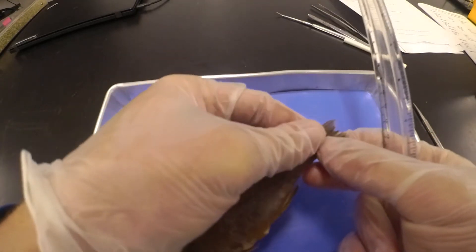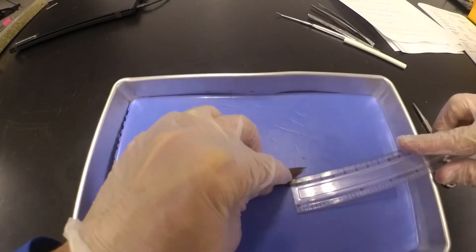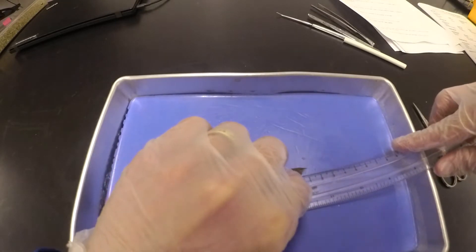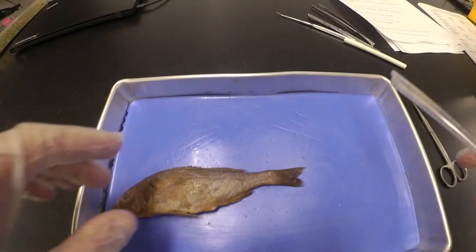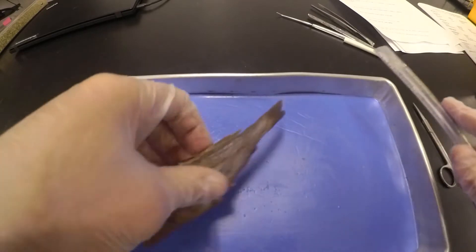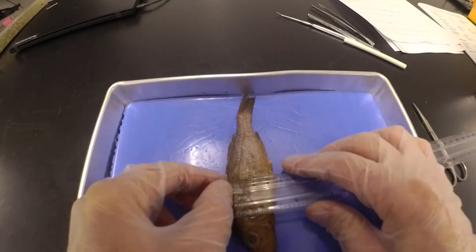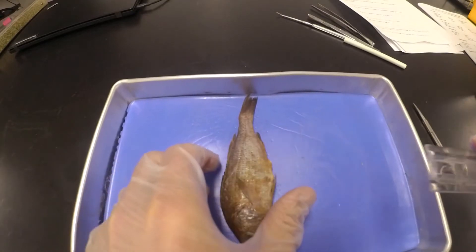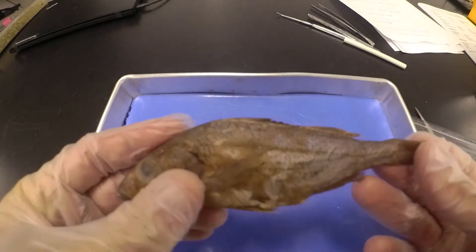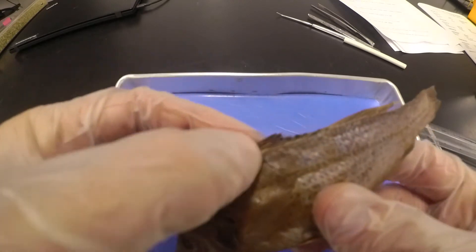Then we'll look at the caudal fin, the tail fin, and we'll see how deeply it forks in. Going inside that fork with the zero point, we can see it goes about 1.1 cm on that fork. So 15.8 cm long, 1.1 cm on the fork, and then we'll measure how fat or how girthy he is — looking at about 3.6 cm on the girth.